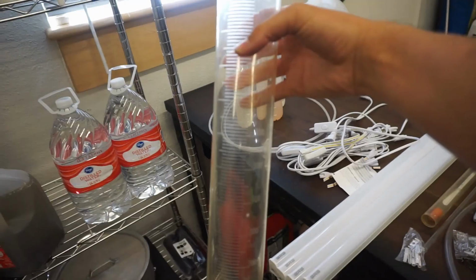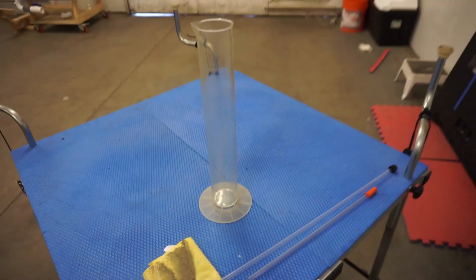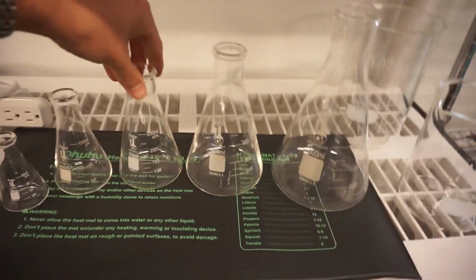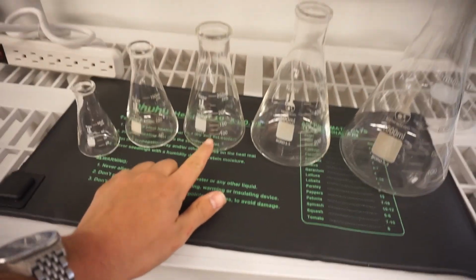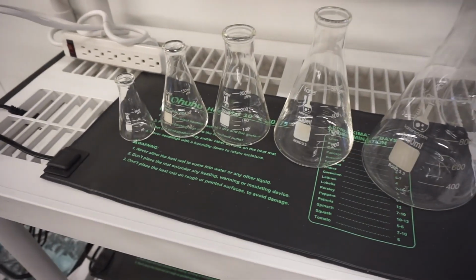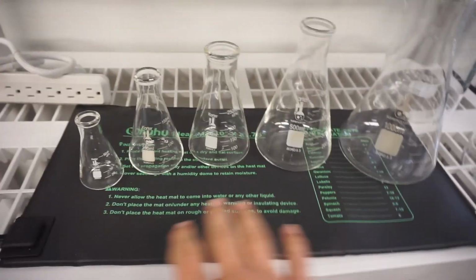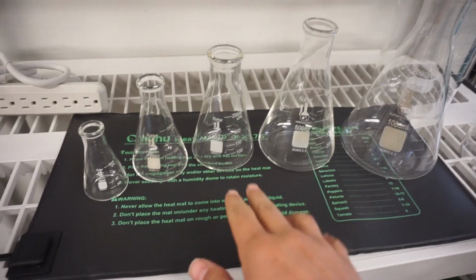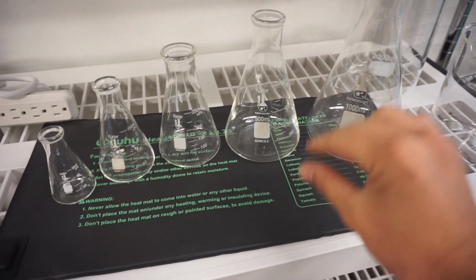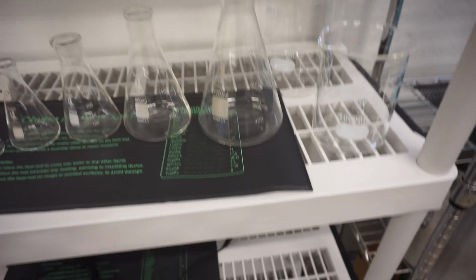Yeah, this is just a graduated cylinder from Nalgene. So I'll probably use this to measure everything and make sure, let me set it down so you can see it. I was reading in the reviews that, because these guys are a little bit cheaper, the measurements might not be perfect. So I'm gonna measure everything with that Nalgene graduated cylinder because I know that's a reputable brand that isn't gonna mess up their measurements. So we're gonna measure everything out in here, make sure it's accurate. If it's not, I'll make little markers and indicators on where they actually are accurate, if it's a little bit above or below, and that way we can be as precise as possible.